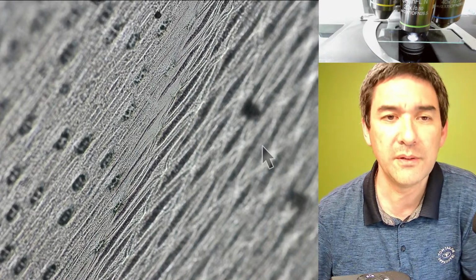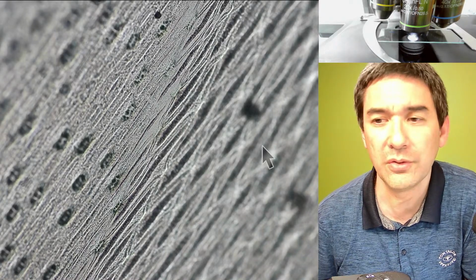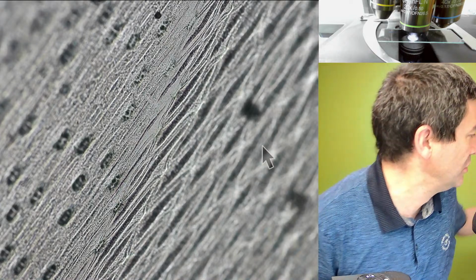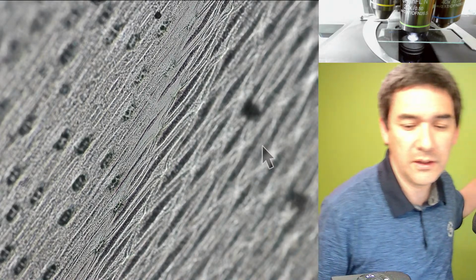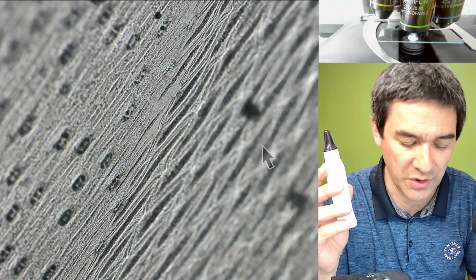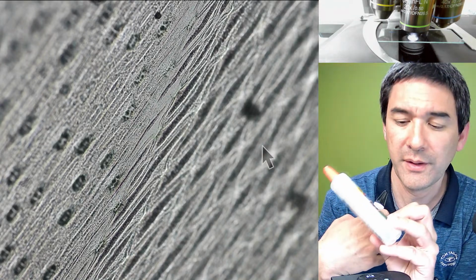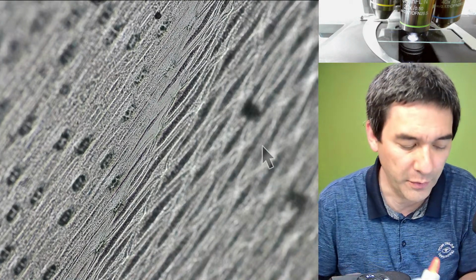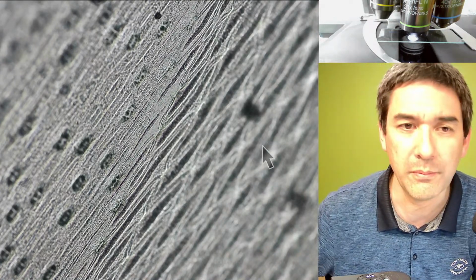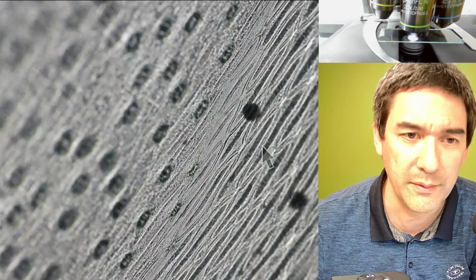So this is just something I wanted to share with you today again. I have used two different types of glue. Can show it to you as well. One of them is just regular white glue, wood glue. This works, and the other one is the clear PVA glue. Both of them should work. I've received basically success with both of them.